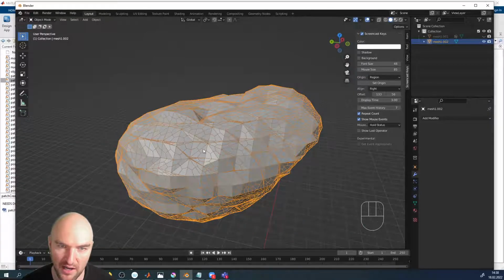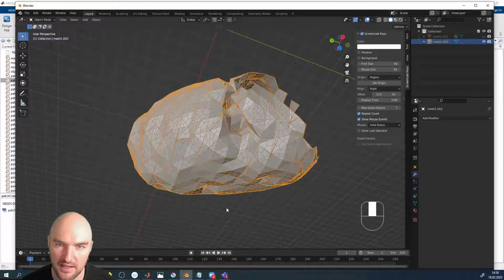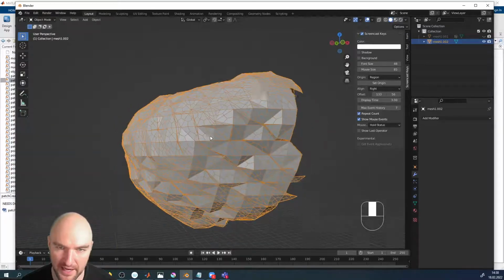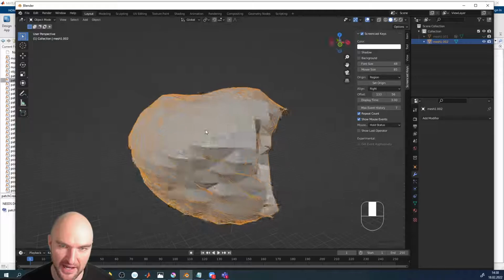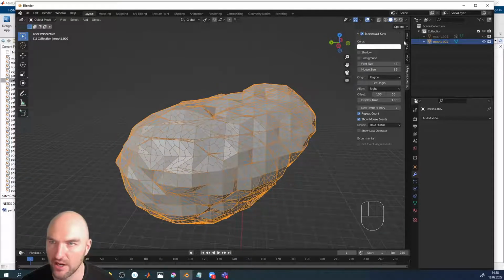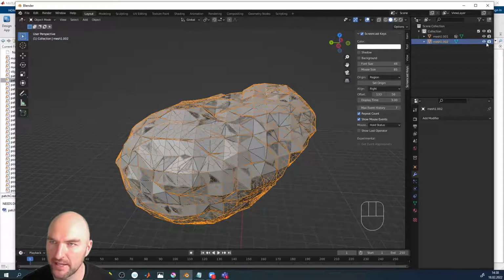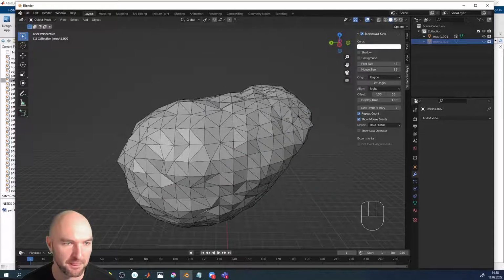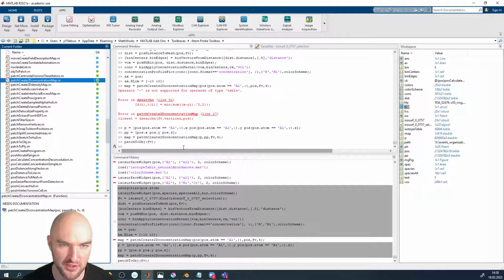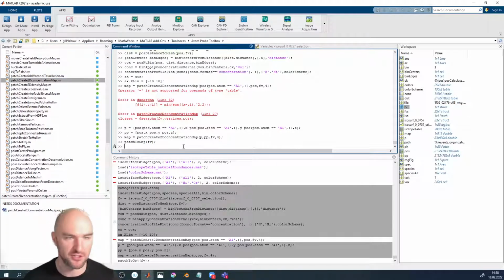And now if we mark all of that, we will get a finer resolution with marking. That's why I said creating a finer mesh is always easier than creating a coarser mesh. It's a little bit counterintuitive, but that's the way it is. Because subdividing a mesh is always easier than coarsening a mesh.